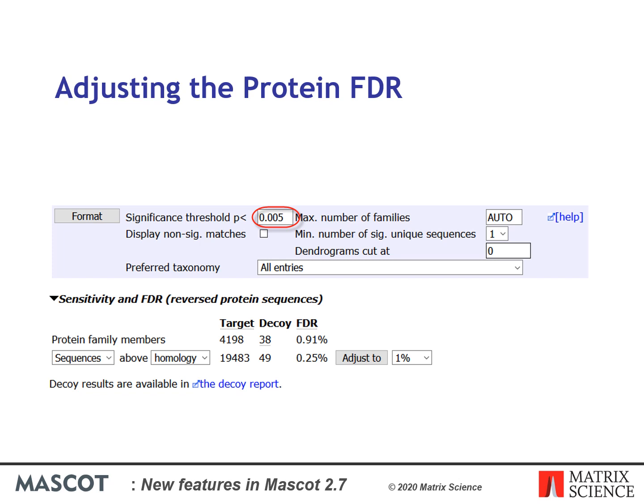When interpreting the results, a protein FDR of 1% only tells us that 1% of the proteins listed are wholly false. This doesn't mean the other 99% are correct. Particularly when there are same-set proteins, we cannot say which one is correct. This is because database redundancy causes protein inference ambiguity, and we can account for the PSM evidence using several sets of proteins. It is important to remember that a protein accession number in the summary report does not mean this is the correct protein. It means the correct protein is likely to be very similar to one of the set of proteins represented by this family member.